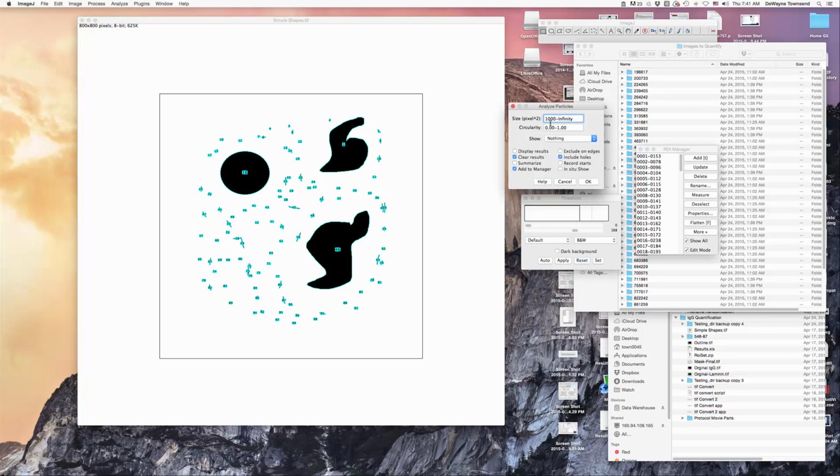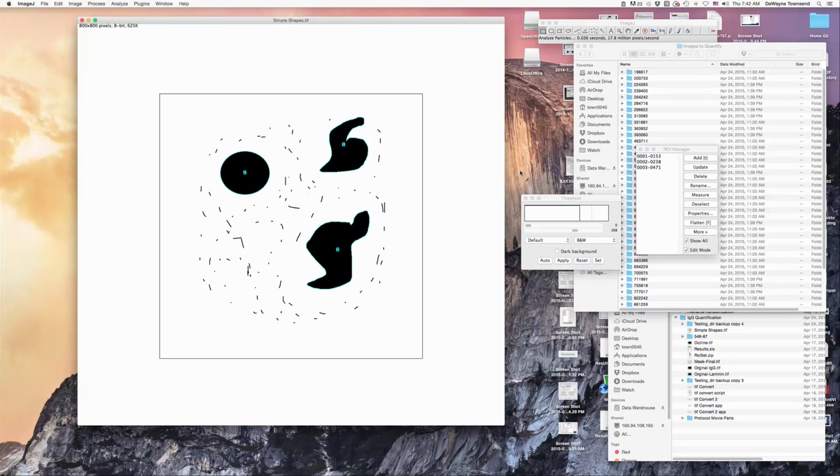If you put 1,000 pixels in here, it's not a small myocyte-sized area. Of course you can adjust this if you find that it's automatically excluding areas that you wish it would include, and we can talk a little bit about how to manage that. But at the end of the day, this 1,000 seems to work pretty well. Alright, so we're going to just rerun this analysis and see how that works.